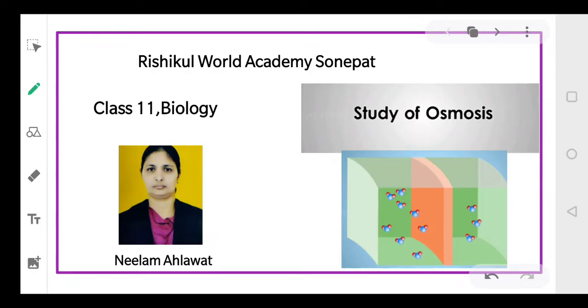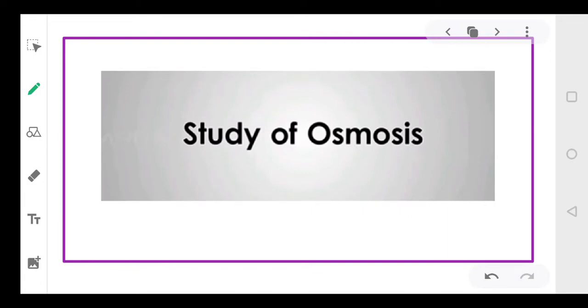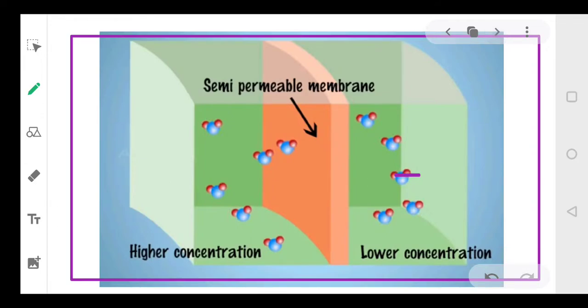So today we will take the first experiment, that is the study of osmosis. Okay dear students, before we go further, we will understand what osmosis is. Let's discuss what is osmosis.